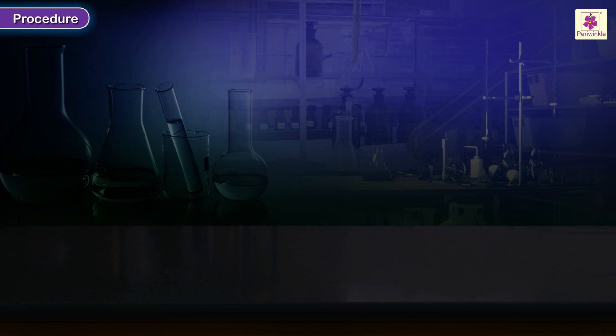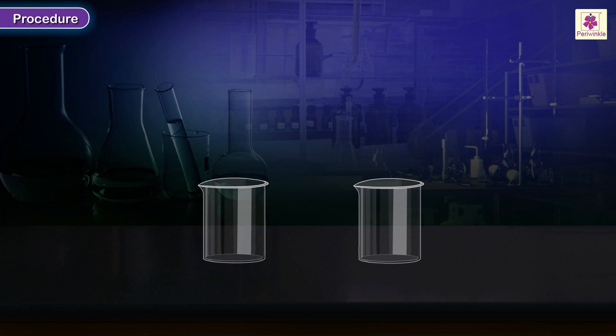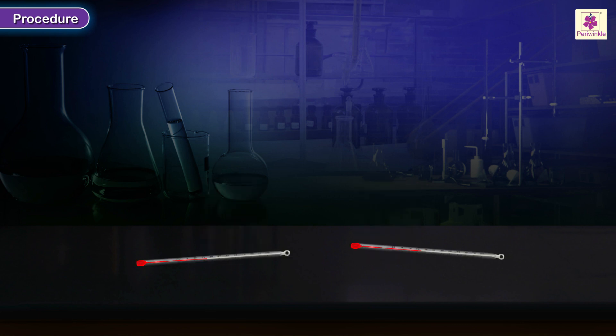Procedure. Take two clean beakers, one labelled A and the other labelled B. Take two clean mercury thermometers, T1 and T2, and note down the temperatures of the respective thermometers after exposing to air for about five minutes.